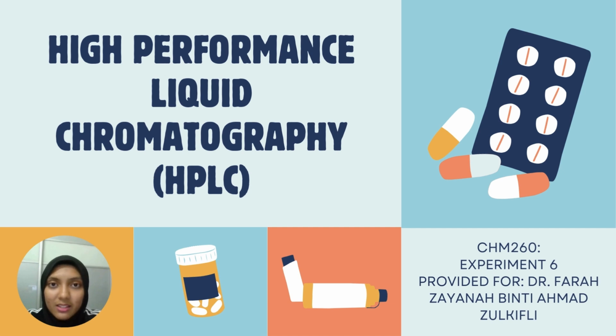Today we're going to explain in detail the high performance liquid chromatography, or HPLC, experiment. The content of this video includes the introduction, objectives of this experiment, methodology, results and discussion, and lastly the conclusion that concludes this experiment. So let's start.